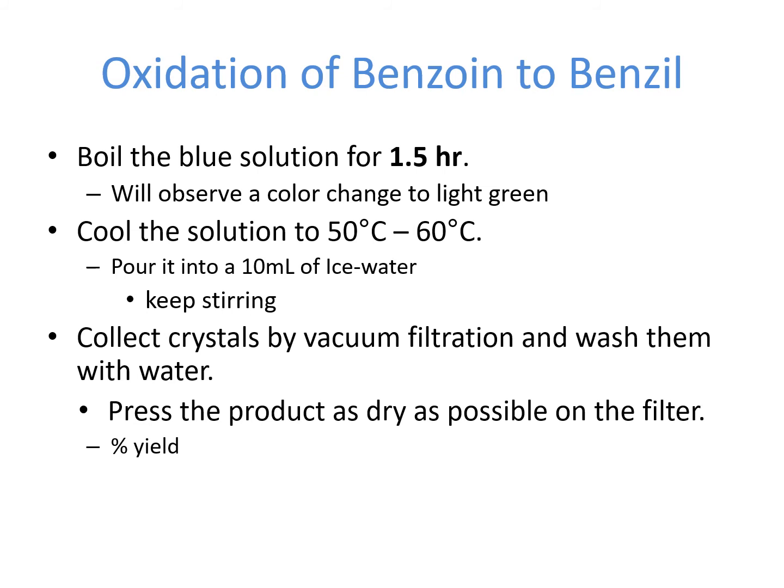Crystals shall be formed, and we filter those crystals using vacuum filtration, which is a cold filtration, and then we wash them with water, preferably distilled water.